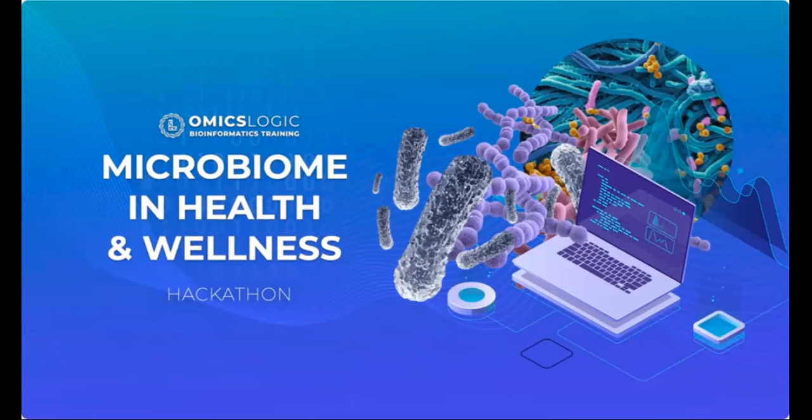In today's session, we will discuss some basics, for example, what is metagenomics, which, simply put, is a way to study and explore the microbiome. And how is metagenomics different from other types of omics data and other types of omics analysis? We will also talk about how the data is prepared, processed, and analyzed for metagenomics, and how it can be interpreted and what it actually describes.